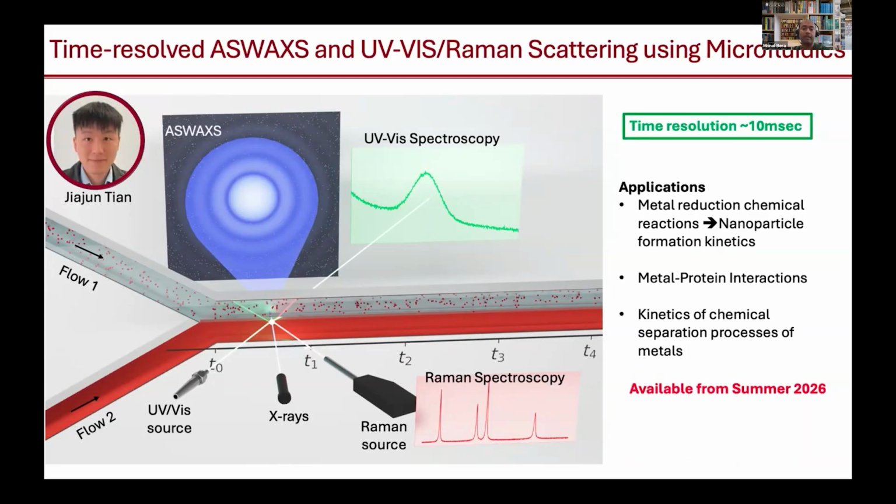For instance, microfluidics, where people have already done SAXS measurements to show that it can provide you time resolution. As the cartoon shows, you can do experiments where you mix solutions together, react them, and then study them over the length of the microfluidics channel. So that's what we are trying to do here.